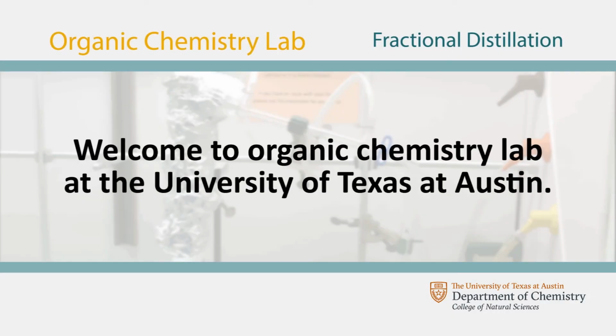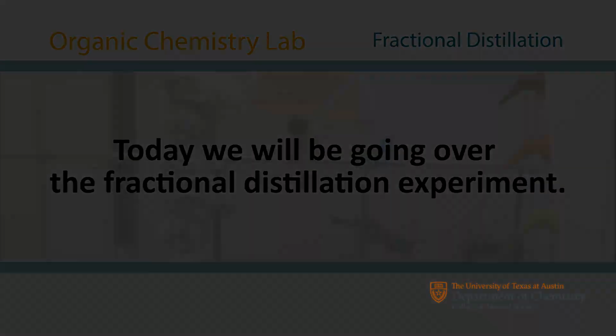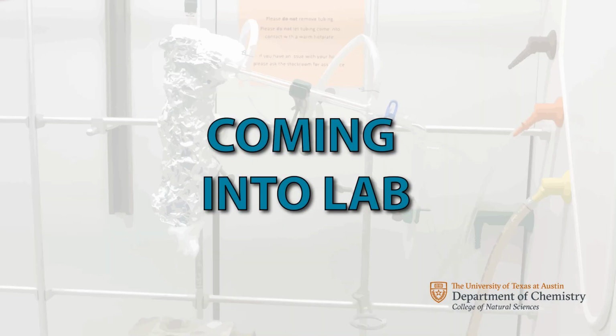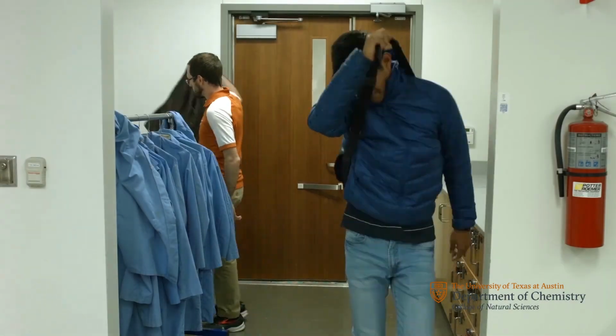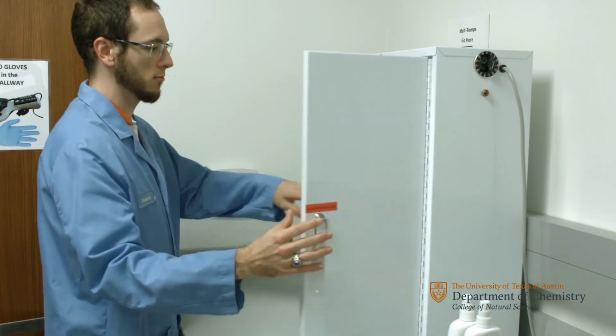Welcome to Organic Chemistry Lab at the University of Texas at Austin. Today we will be going over the fractional distillation experiment. When you first enter the lab, please be sure to put your stuff away into a cubby and then put on your lab coat and goggles.